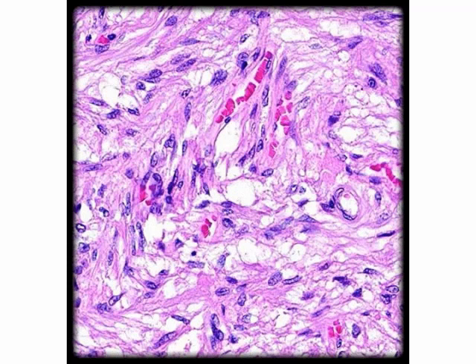On this next slide, now this is still from the pituitary gland, but it's another slide preparation. And again, if I said, is this anterior or posterior lobe, what would you say? If you said posterior, that's correct. It's always good for you to do an online search for other slides. That's easy to do.